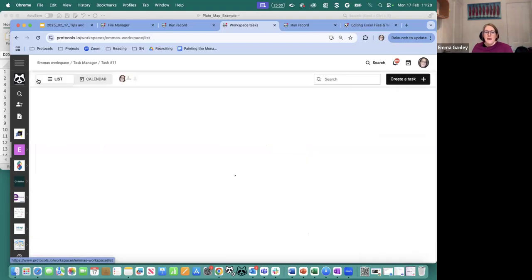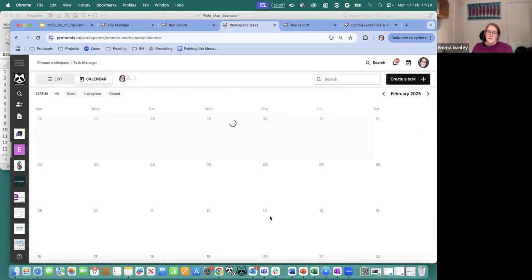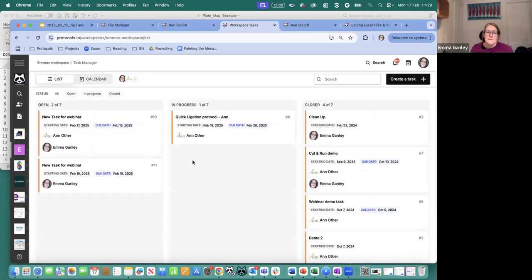So if I go back now, I have a new task for the webinar. This was one here, and that will now be on the calendar, but it will show up on Wednesday. So I've got that one, new task webinar. It's right here. That's on Wednesday, the other one today. If you assign to different people on different days, it will track across different days as well. So there is a lot of really nice functionality in here.